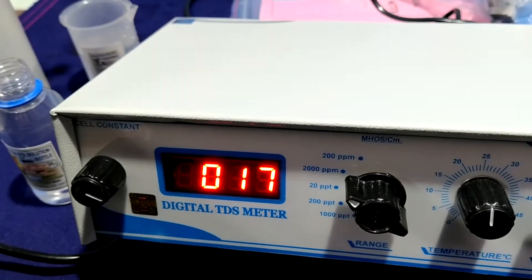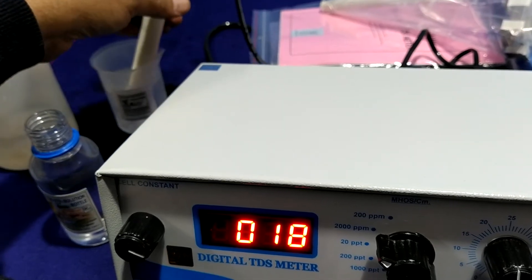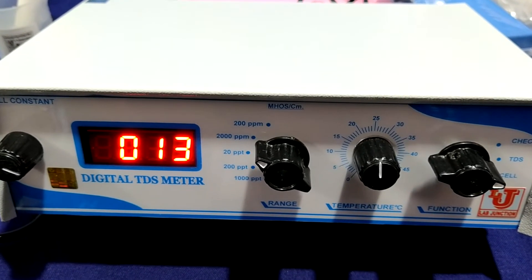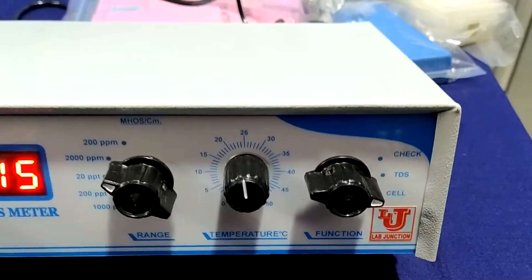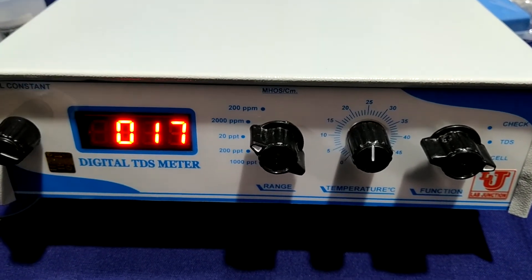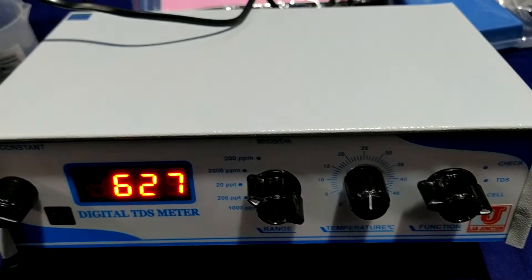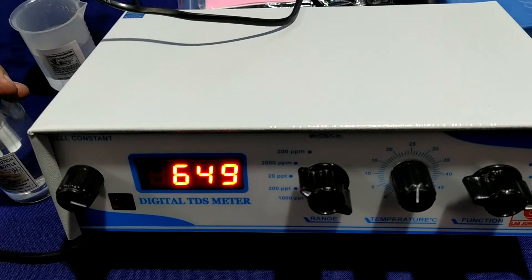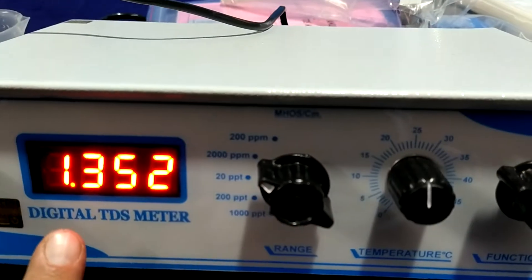Now rinse your cell with distilled water and take the readings. One important thing in the digital TDS method: what is the cell constant? Suppose you standardize on 650 ppm — go to the cell constant knob. Your cell constant reading is 1.352. Note this down in your notebook.